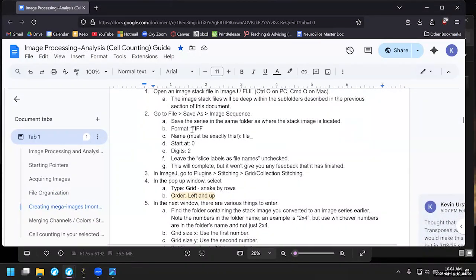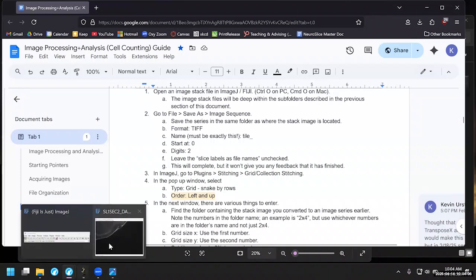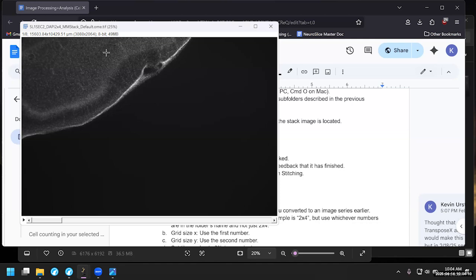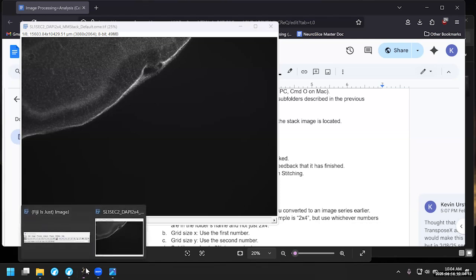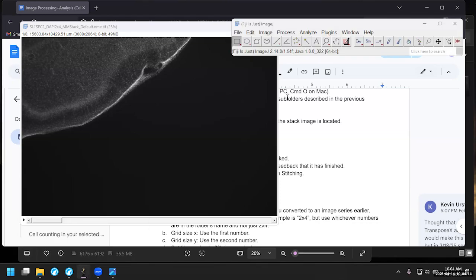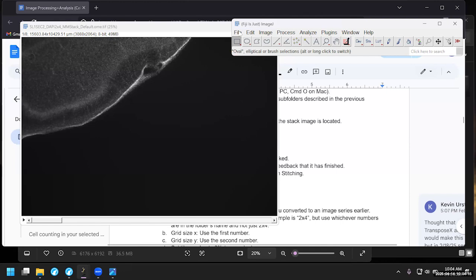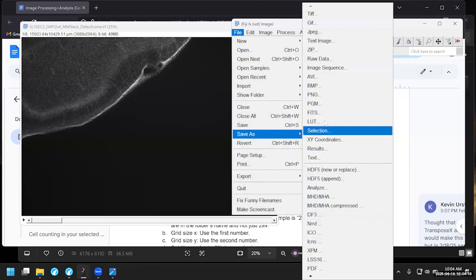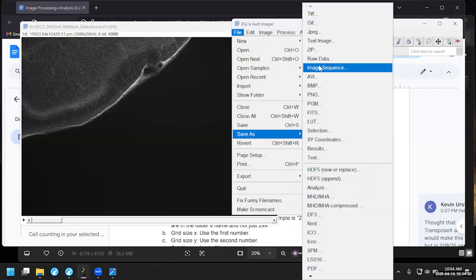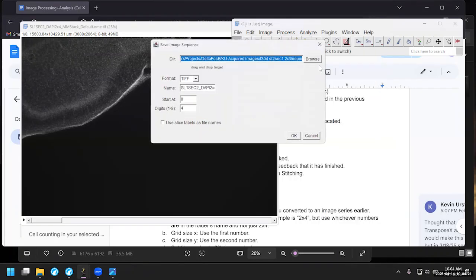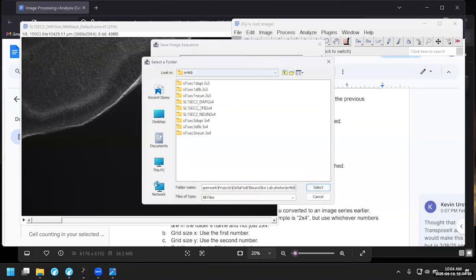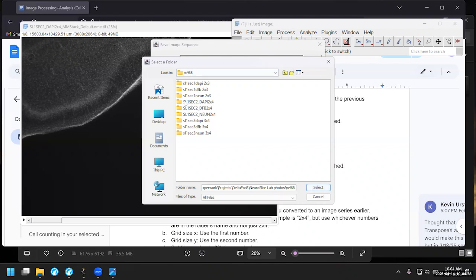So let's actually give it a go once we have this sort of setup. We'll have ImageJ. I already opened up the file. Because of the way that my program works, I have to dissect a stack file into individual images. So let's go ahead and do that. We'll go to File, Save As, Image Sequence. You'll make sure to save these into the correct folder. So let's just double check where they're going. Yes, I want to save it into this particular folder. Subject M468, Slide 1, Section 2, DAPI is the color channel I'm using, and then 2x4.